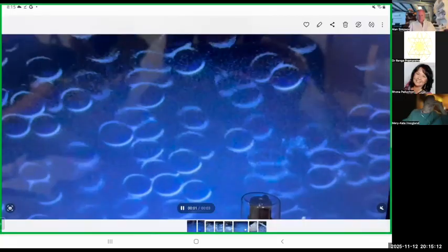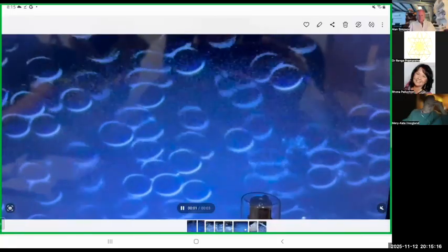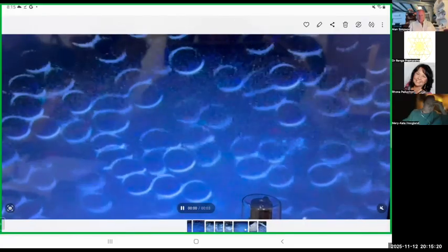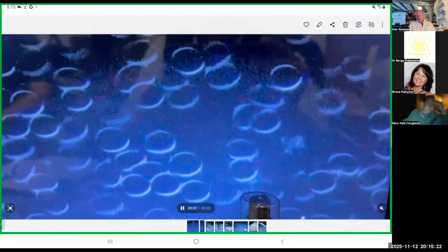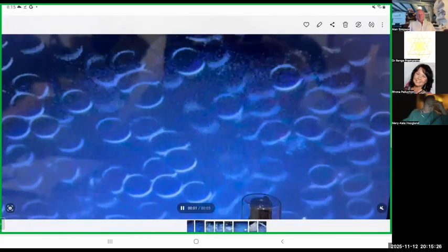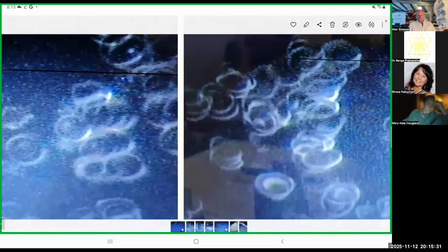So red cells cannot move by themselves. It's just the fluid carrying them, but the cell membrane is so negatively charged that they repel each other, and it's very flexible. So it shows the cell membrane is in the best possible state of health. That's all I have at the moment because I didn't get much of a chance to do it.